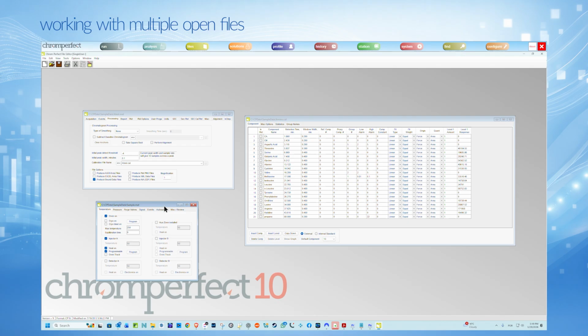When several editing forms are open, only one is active. The active form has a highlighted caption, while the others appear dimmed, as shown on screen. Most file menu actions apply only to the active form. To activate a form, click anywhere inside it, or use the Window menu to select a file from the list.